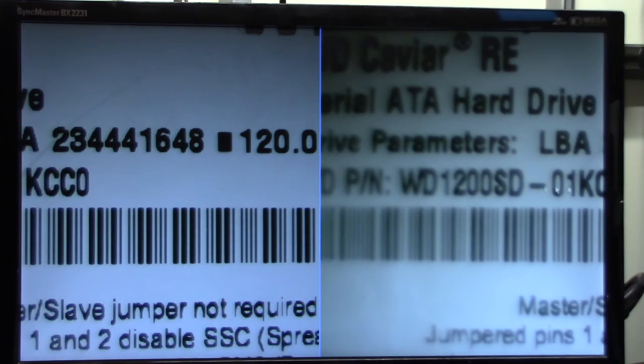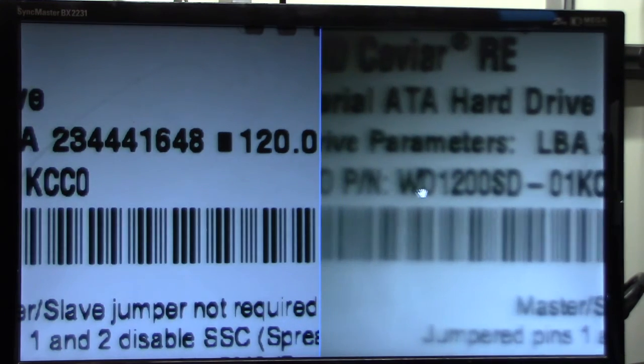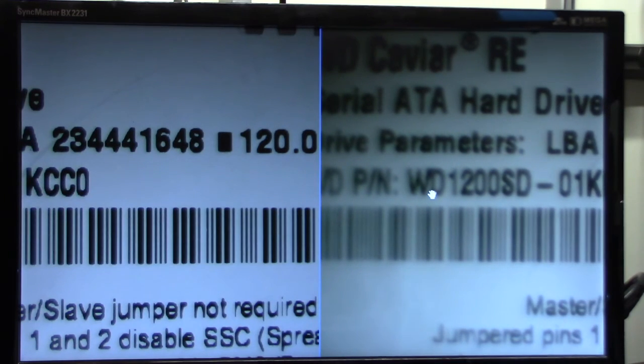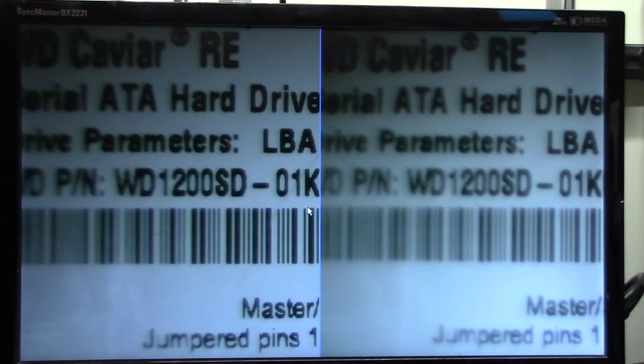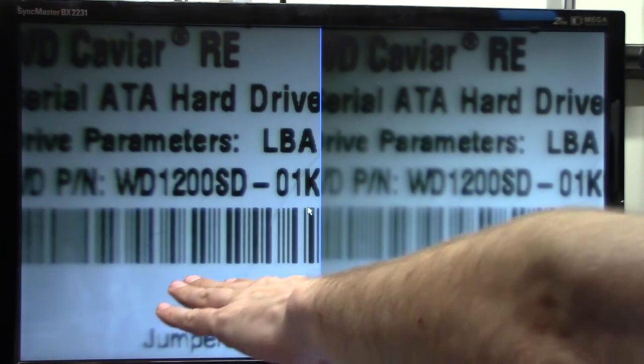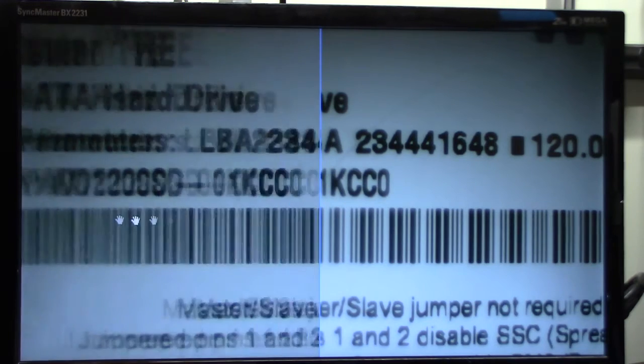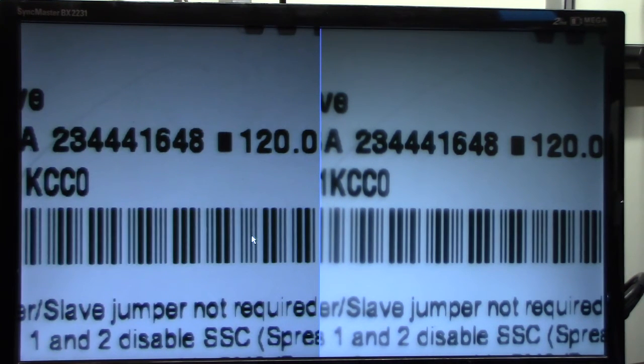If we move this over to where it left off — it leaves off at the A and the K. So we'll move over to the A and the K like that. Look at the difference between these two — unbelievable. The 037 adjustable on the right, fixed on the left, 050. Same magnification. But the focus is just absolutely horrid on this. There's not much more I can say about this.